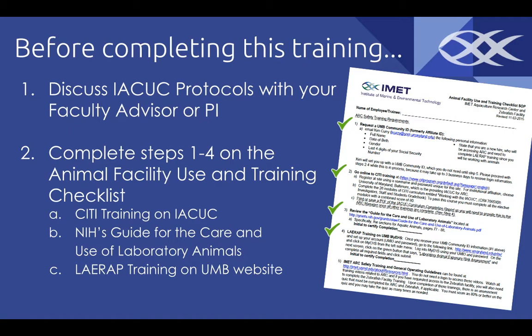This ARC training video provides a general understanding of the operation of the facility, emergency procedures, describes safety concerns, and general operating procedures. Additional information on IACUC's role and responsibilities will be discussed later in this training. From the ARC Animal Facility Use and Training Checklist SOP, you must have completed the following trainings before completing this video training: CITI training on IACUC, NIH's Guide for the Care and Use of Laboratory Animals, and LAERAP training on UMB's website. Please see the Animal Facility Use and Training Checklist SOP.